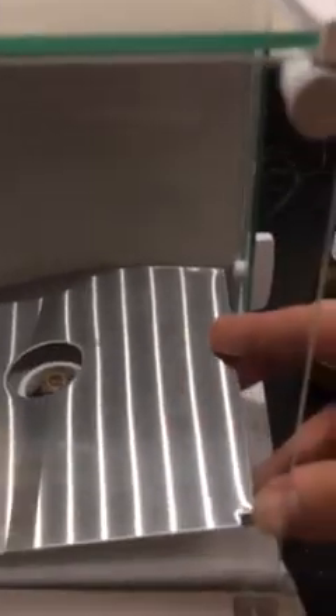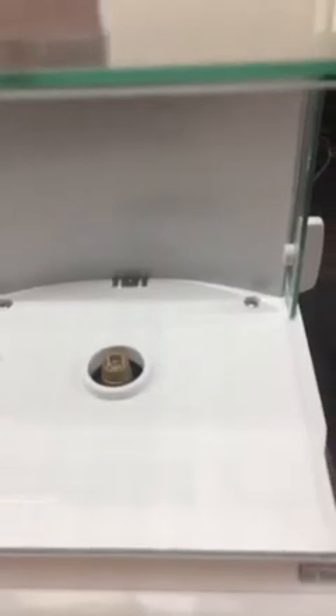Then this piece also lifts up. Notice the notches here — that shows you which area it goes to. Also the back half is rounded, so it goes to the rounded back half.